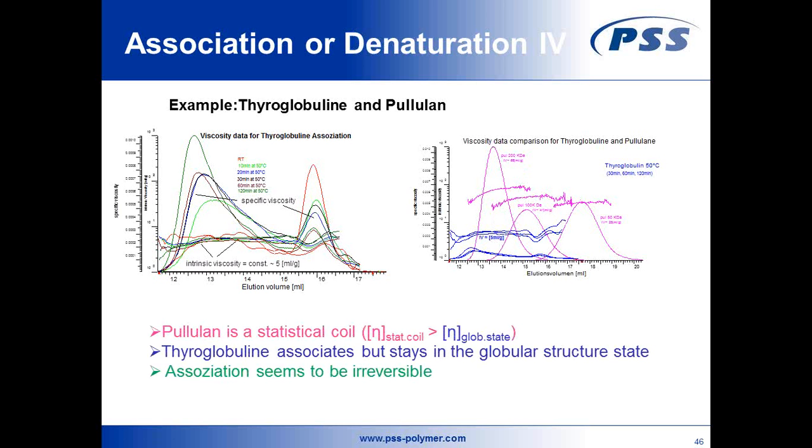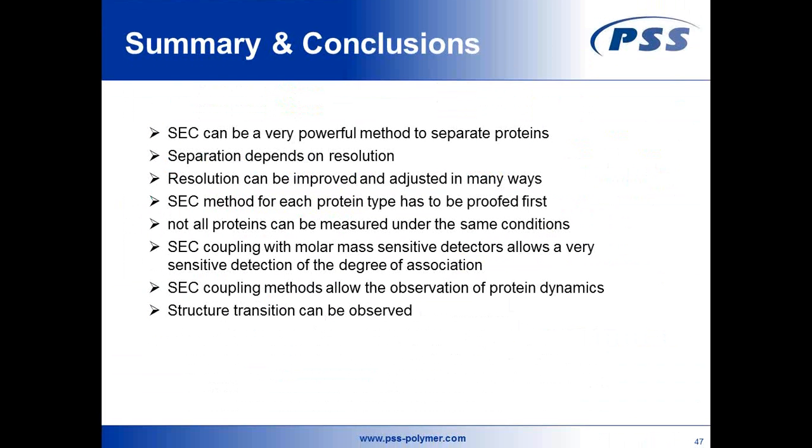So we could finally prove, by using an SEC light scattering, using an SEC viscometry experiment, that you can use it to study protein dynamics, and we could prove under native conditions, when a protein got stressed and measured under native conditions, that the protein is not denaturing before aggregation, and protein aggregates to higher units in order to protect themselves.